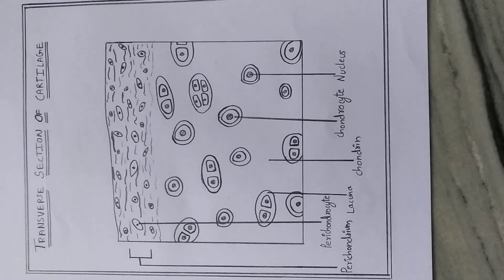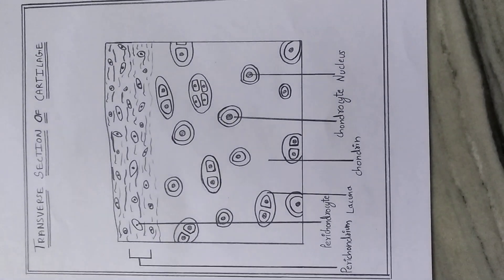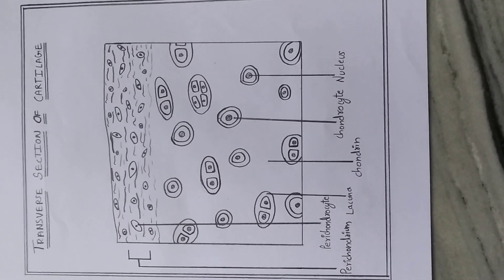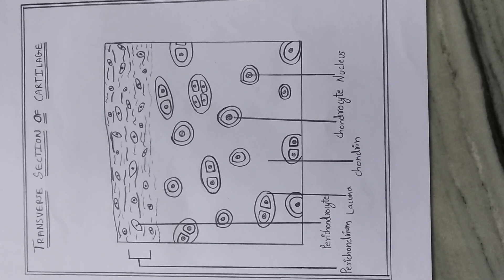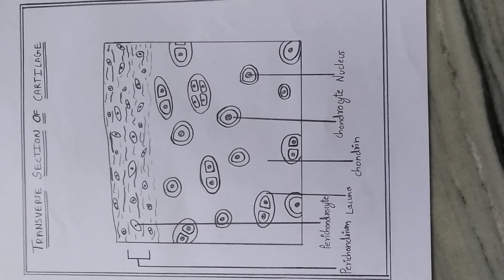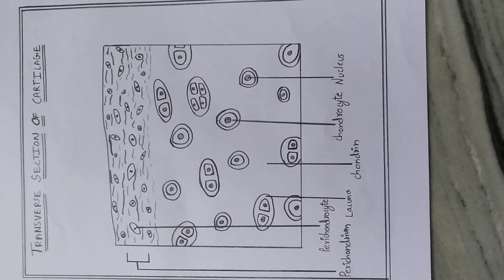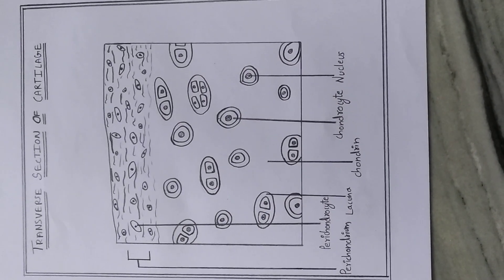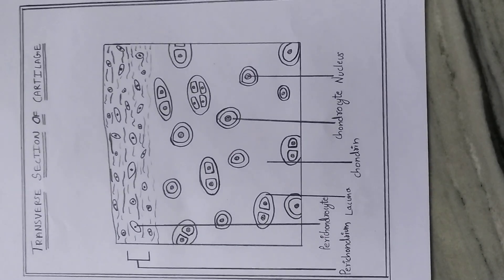Cartilage is avascular, with no blood vessels. The ground substance of the matrix has two kinds of fibers: elastic fibers and collagen fibers. Cartilage is enveloped by a sheet called the perichondrium.